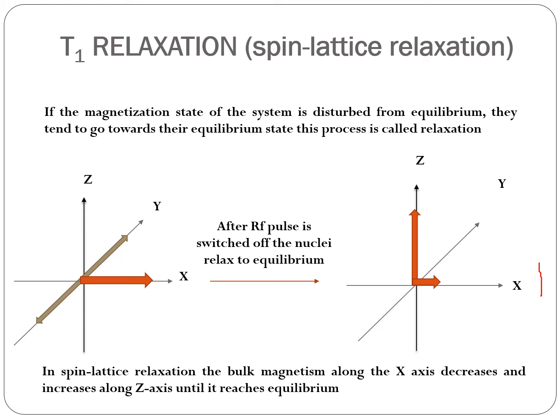So at the first point or first second it is more, whereas slowly the time increases and the intensity decreases as the relaxation process proceeds. What happens? The intensity of the x also decreases. Therefore, the detector will detect the intensities at these points. So this is called as spin lattice relaxation.